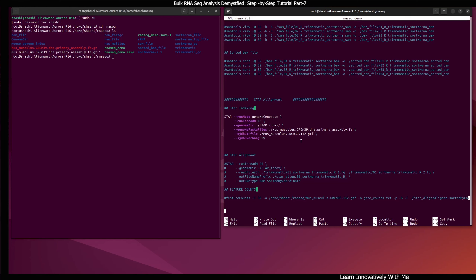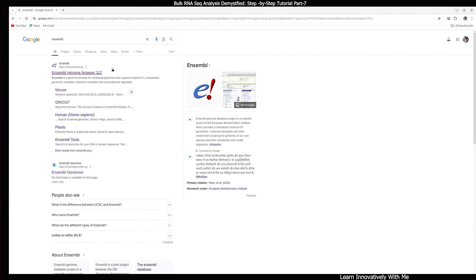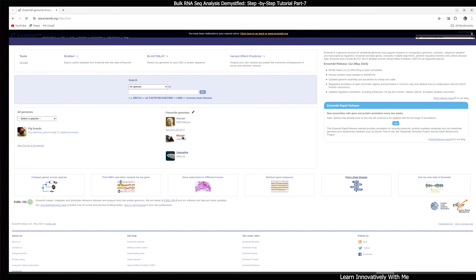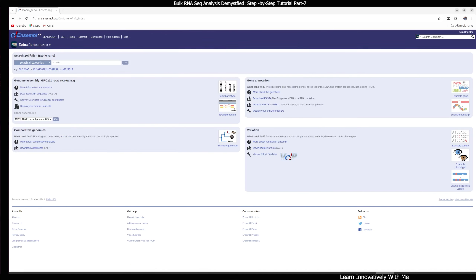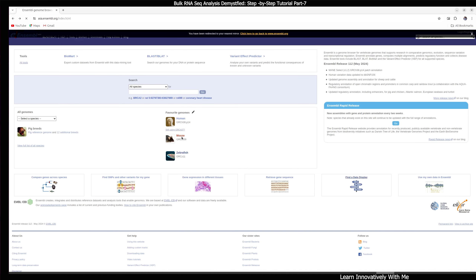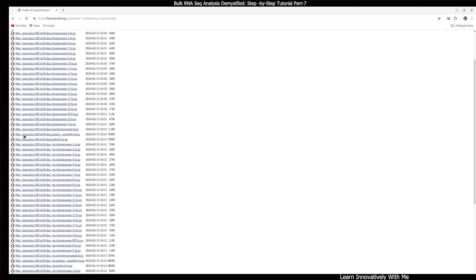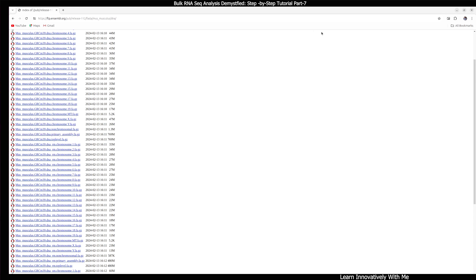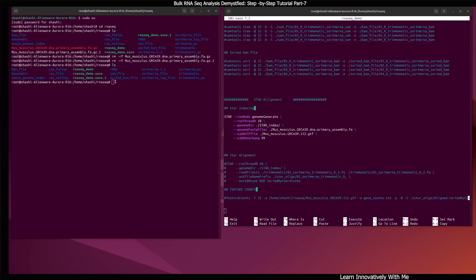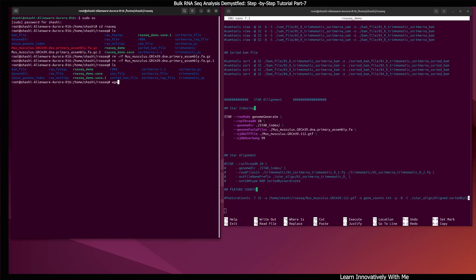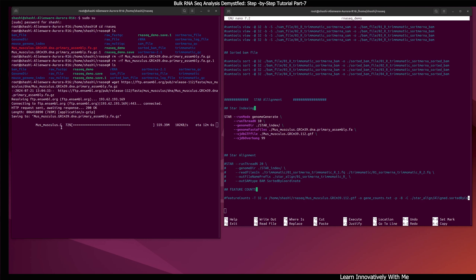To download the genome file, search Ensembl in Google and open the Ensembl genome browser. Here you can see the mouse — search according to your requirement. Click on the mouse, then click 'Download DNA sequence' and select the primary assembly. Right-click and copy the link address, then in the terminal use the wget command and paste the link. Press enter — here you can see the mouse genome is downloading.